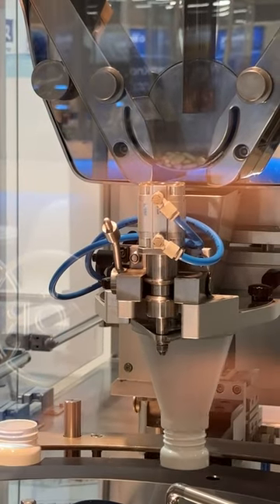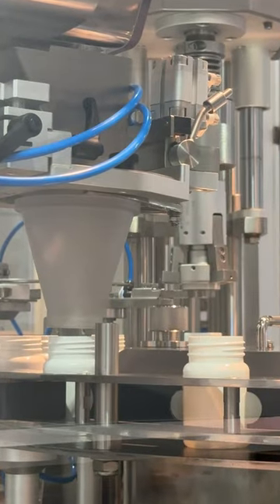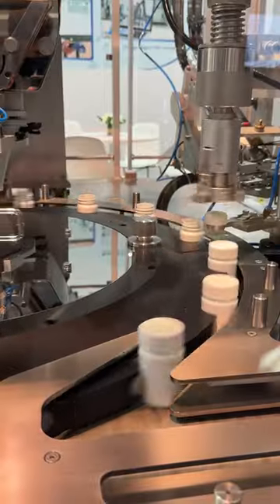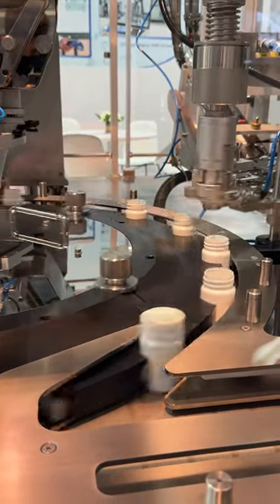It has the tablet counting machine here in the middle. This is all servo-driven, so it's highly accurate. And then finally, it has the capping machine — a one-chuck capping machine.